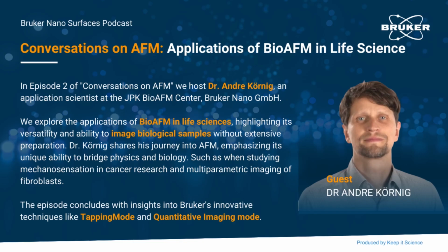So the other advantage, now more for science-related things: biological matter often needs some medium around it, so you have to be in liquid, which makes all the electron microscopy a bit more difficult. And in the AFM, whether you immerse this cantilever in some liquid or medium or whatever, is rather easy. And also heating and temperature is no problem. So this also makes it very, very well suited for biological applications.